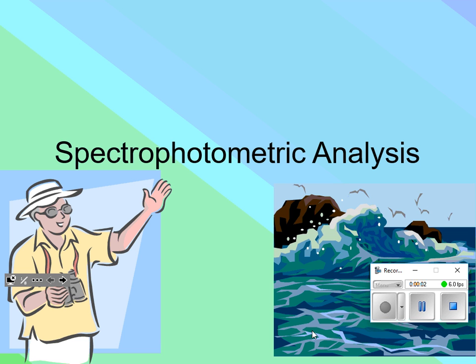Notes on the spectrophotometer. Again, this is not something that you are going to be quizzed on. Tell me how the spectrophotometer works inside and out. That being said, on AP exams, they always have questions that deal with the techniques of things.